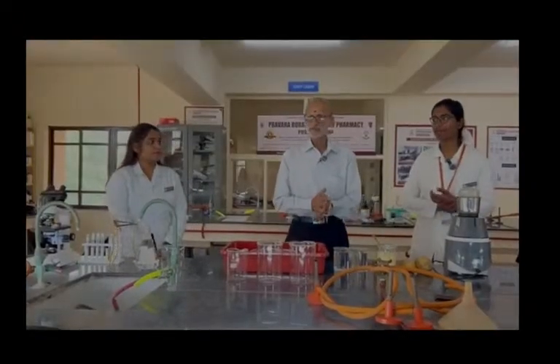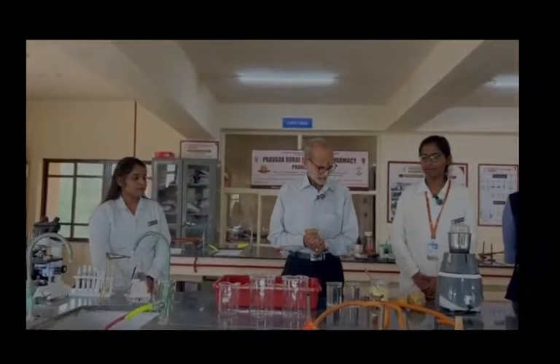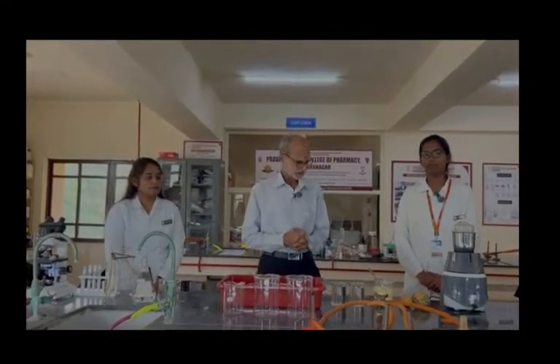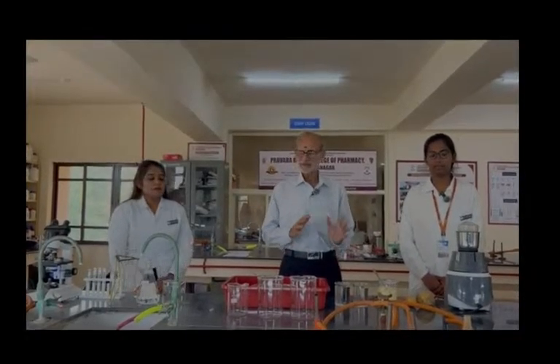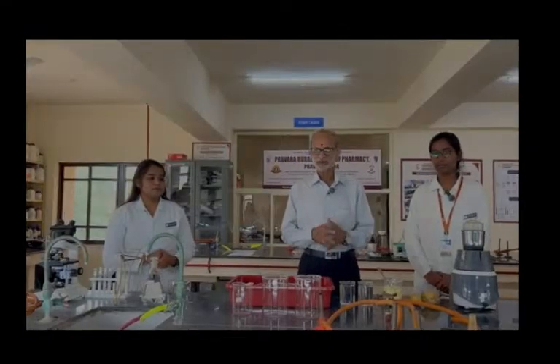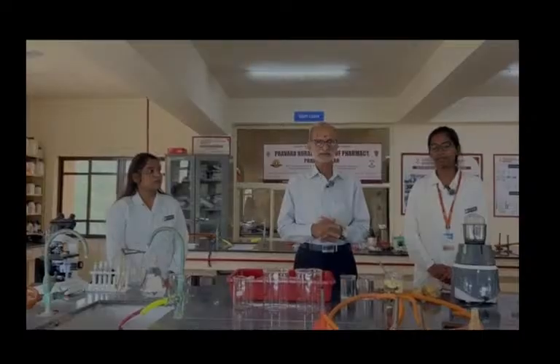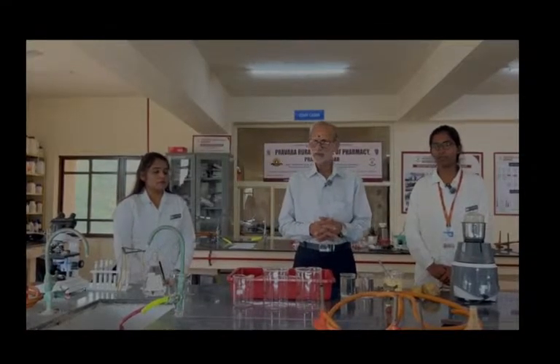we are going to begin with the very first experiment, that is separation of starch from potato. Let me give some idea about the starch. Starch is extensively used in the industry, whether it is food industry, pharmaceutical industry, or textile industry, or the paper industry. So starch really has good importance in the society. And we are going to begin. There are three important starches. Number 1, and most widely used starch, is a cornstarch. Number 2 is a potato starch.